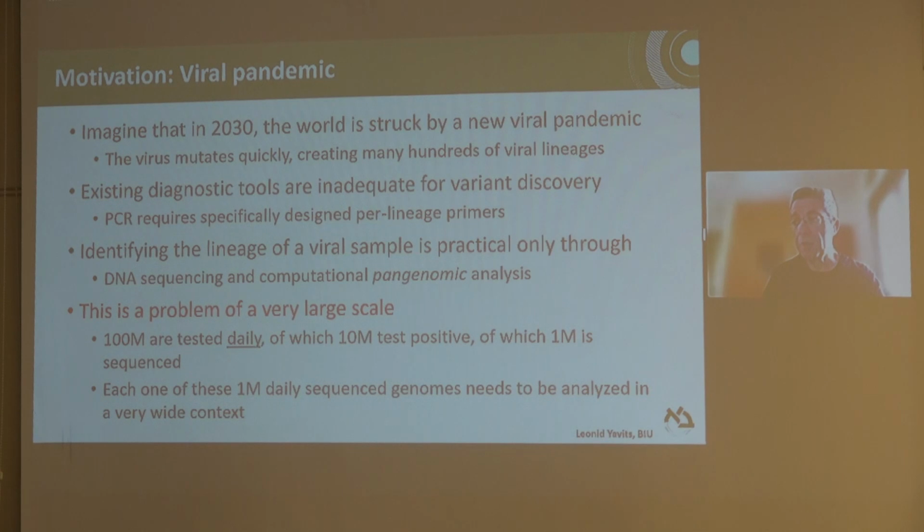Now the problem here is that this is a very large-scale task. Again, based on the lessons from the COVID-19 pandemic, we can easily assume that we're going to test hundreds of millions of people daily during the next viral pandemic, of which 10–15% may test positive, of which we're going to again sequence 10–15% to create statistically significant results.